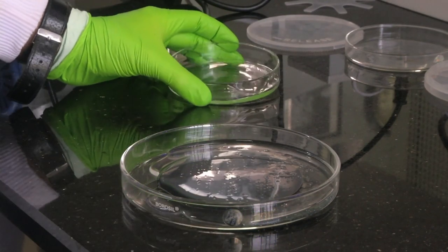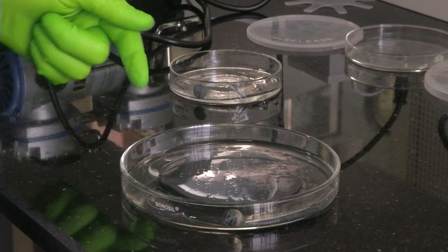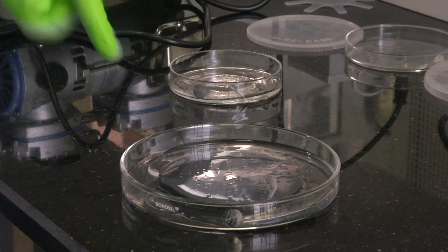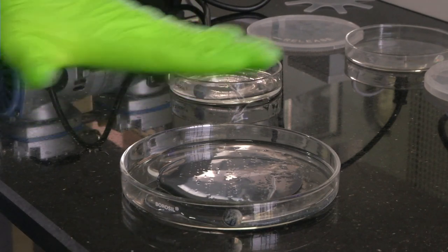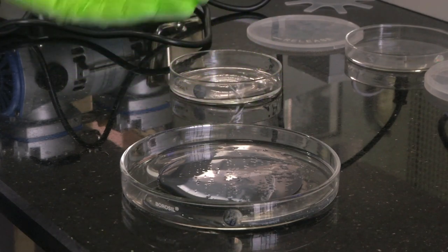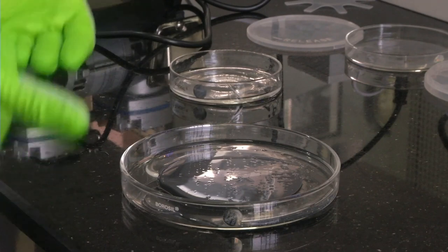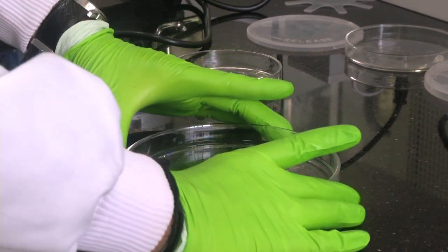We are pouring the PDMS onto the mould. This process also creates air bubbles. Now we have fully poured the PDMS on the mould - it is evenly distributed but there are still a few air bubbles formed. Now we have to do the desiccation process again with the PDMS on the silicon mould to remove these air bubbles also.